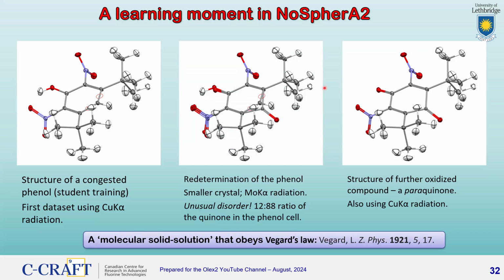It was clear that some serious disorder was going on, and we simply set this aside. Now, when I was writing up this work, I said, let's see if I can solve this disorder problem. And I was very, very pleased to find that, in fact, it corresponds to 12% of this quinone incorporated into the lattice of the phenol. That makes it into something known as a molecular solid solution. And moreover, that solid solution fully obeys Vegard's law, which is the long-standing law for solid solutions and X-ray diffraction.